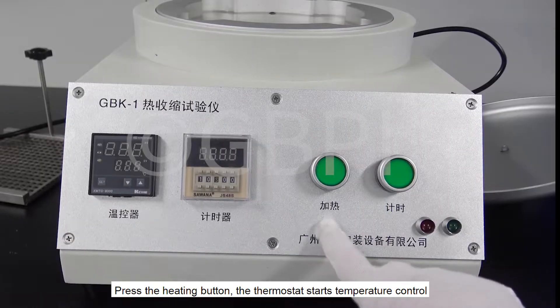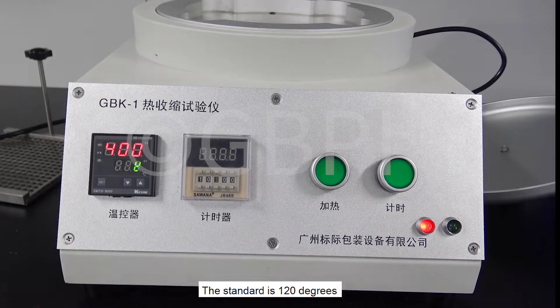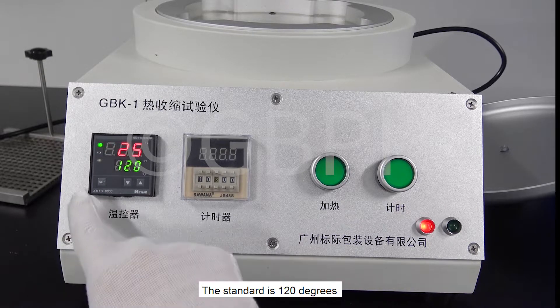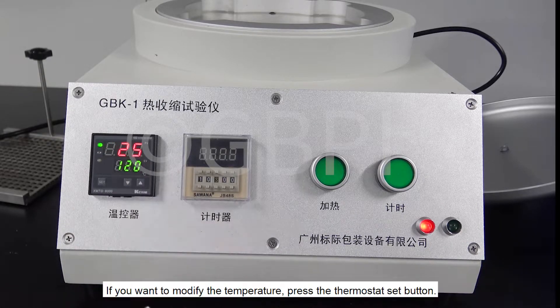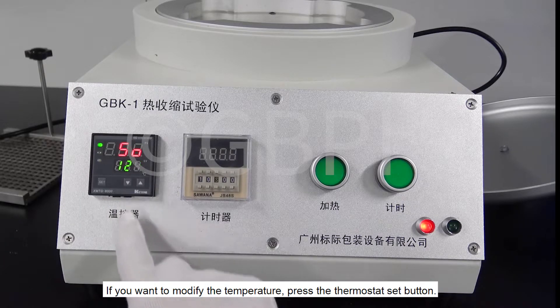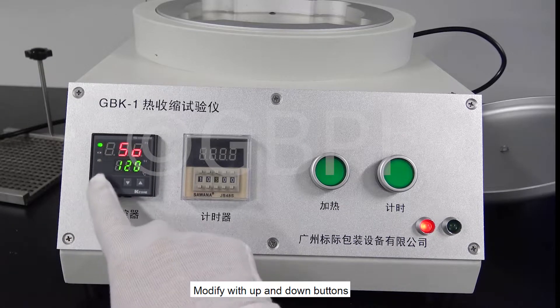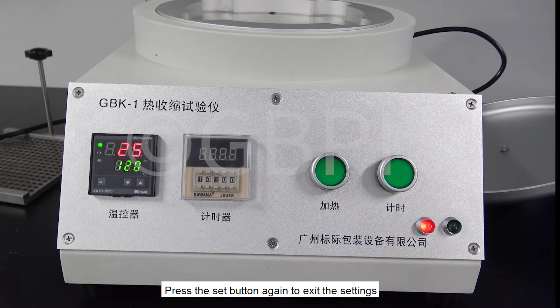Press the heating button; the thermostat starts temperature control. The standard is 120 degrees. If you want to modify the temperature, press the thermostat set button and modify with the up and down buttons. Press the set button again to exit the settings.